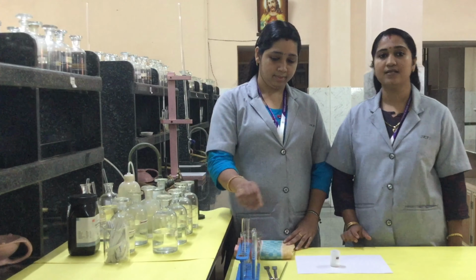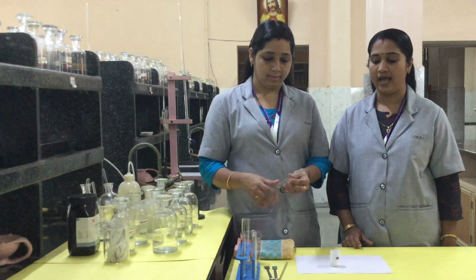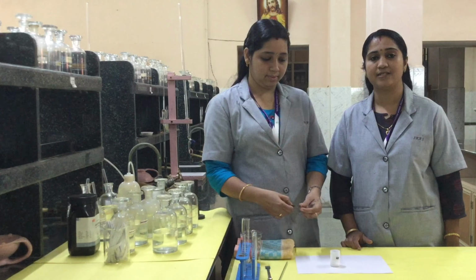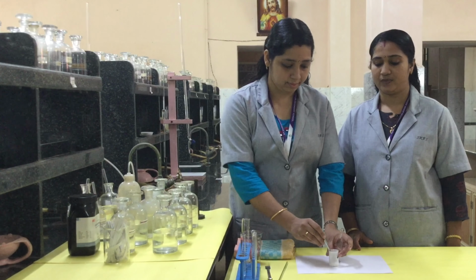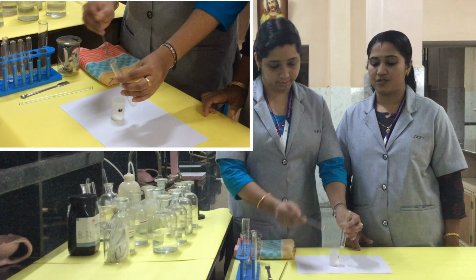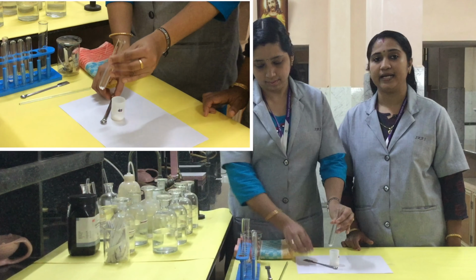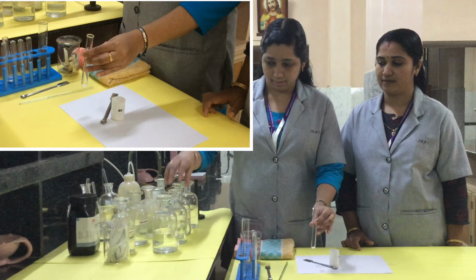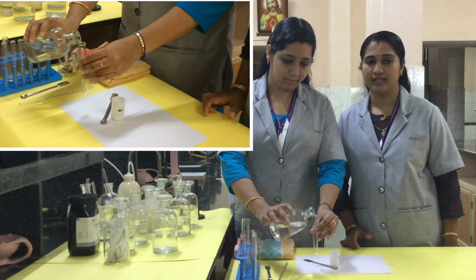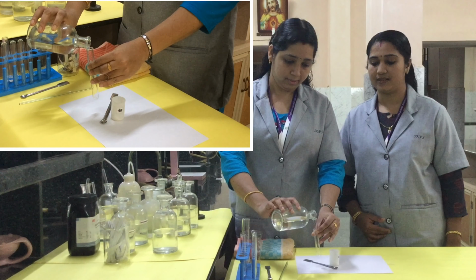So first is the systematic analysis of anions. First is the test for carbonate. A little of the salt is taken in a test tube and dilute hydrochloric acid is added. Dilute HCl is added to the salt taken in a test tube. Then observe the change.